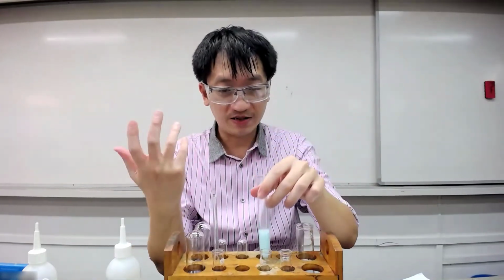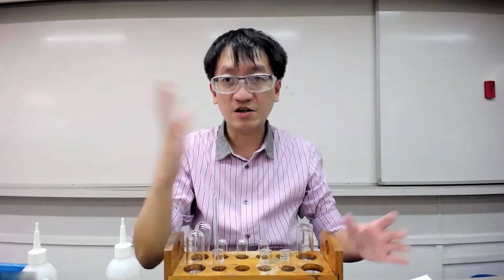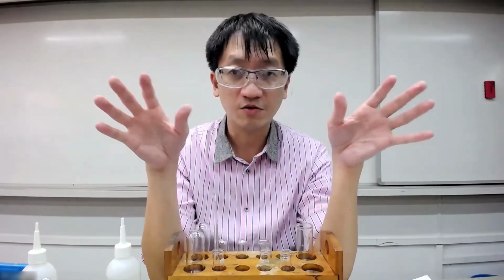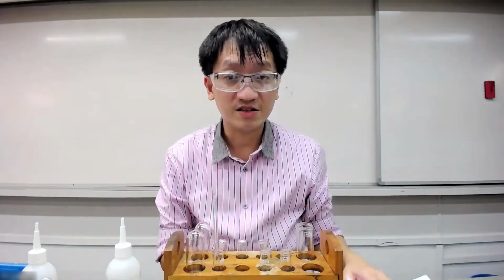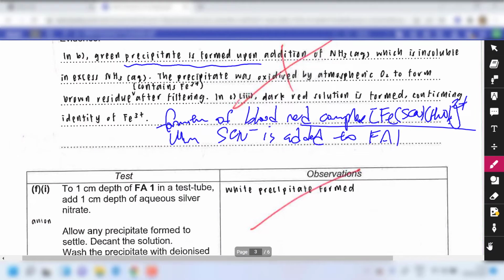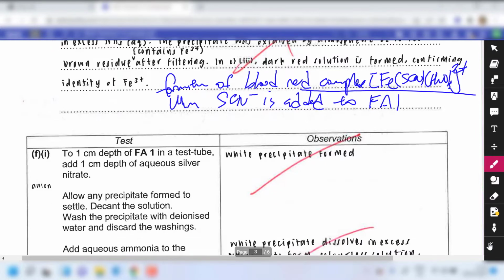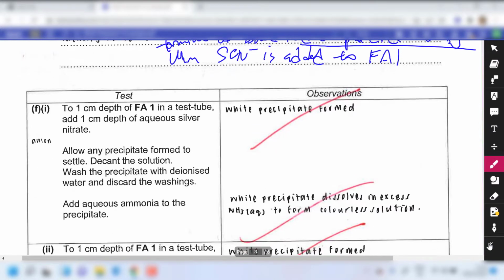So that's it for the demonstration, showcasing to everyone how to perform the experiment. And then I think the rest of the review videos will be on how to actually go about attempting the questions. I hope you find the lab video demonstration informative. So we will move on to look at what we should be writing for the observations.